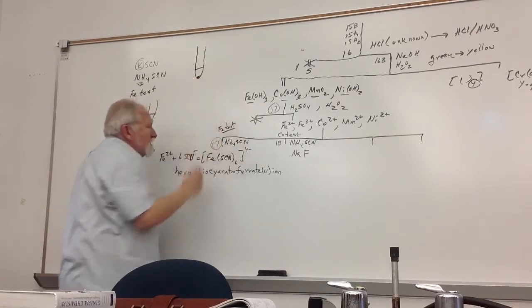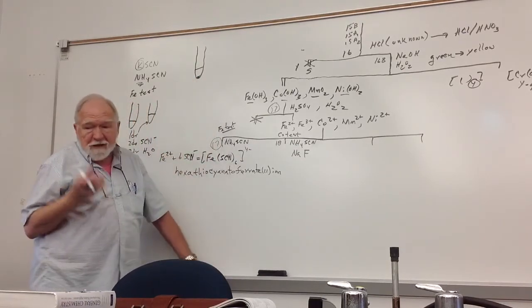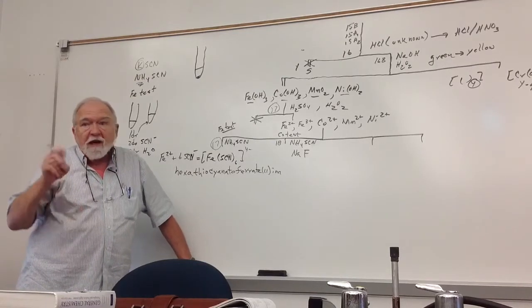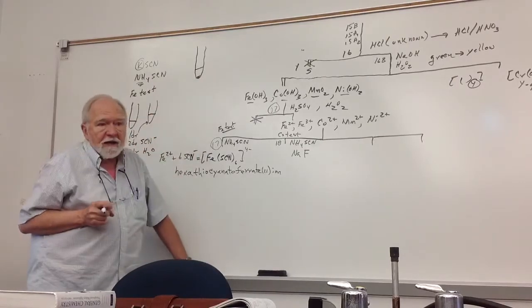So you should have a little bit of solid. First you stir it up, then you centrifuge it, and you'll have a little bit of sodium fluoride solid left on the bottom. If you don't have any sodium fluoride left, add another little bit. You don't want to fill up your test tube with sodium fluoride.